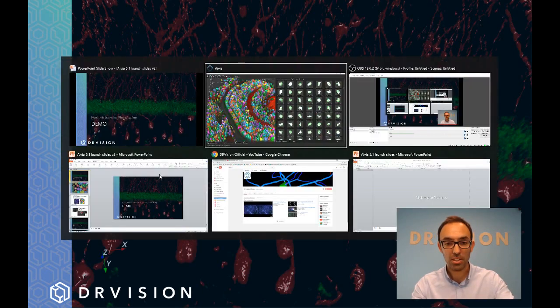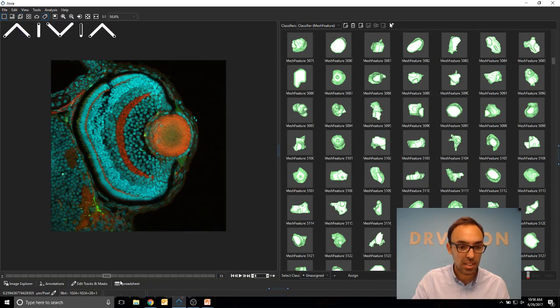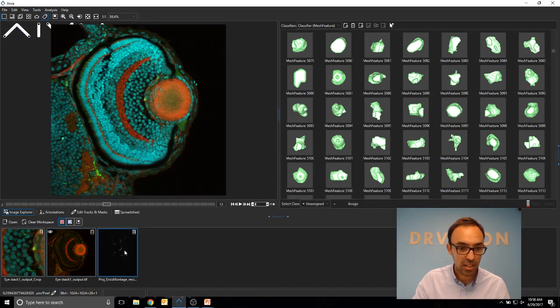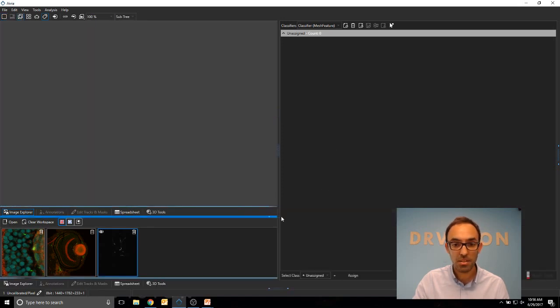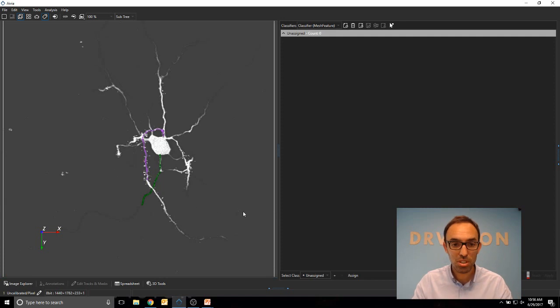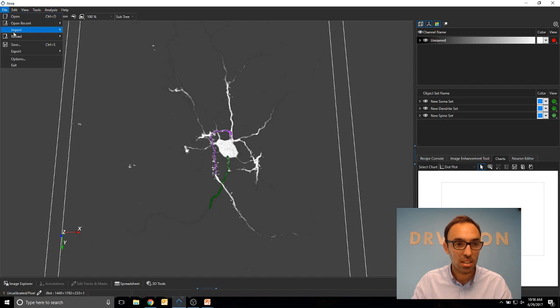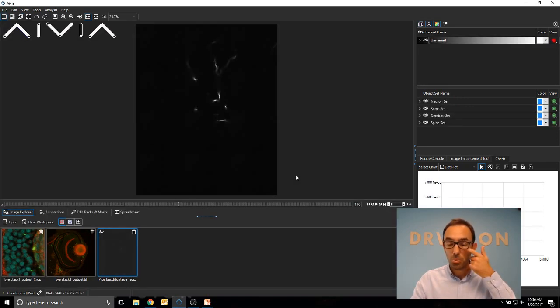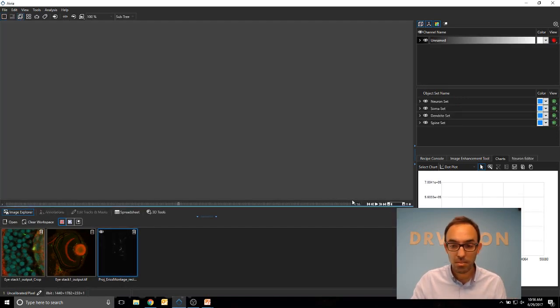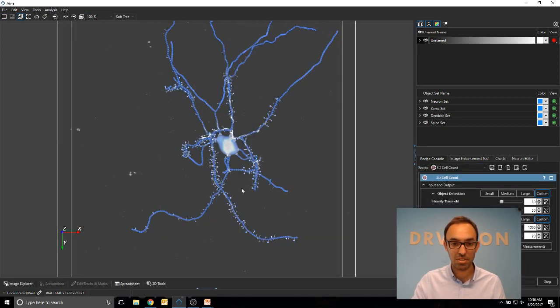Okay, so I'll go back into Aivia. I'll load the other data set, this one here. You have seen this data set before. That's the one I used at the beginning. Just reload. Yeah, so I'll reload it because I've done some edits during the previous demo. So I'll reload it. I have it here.